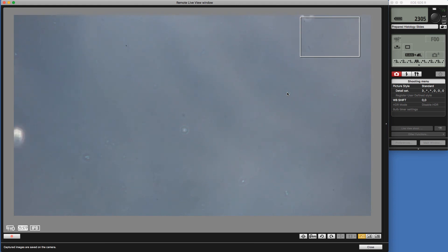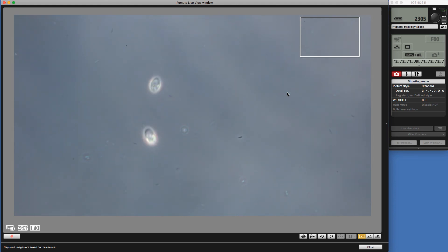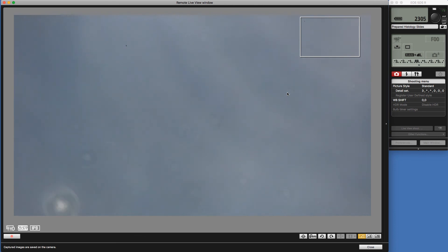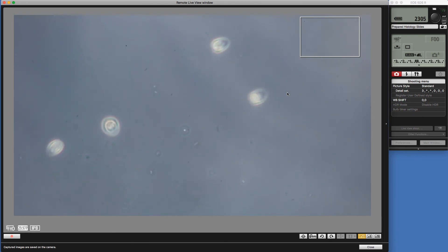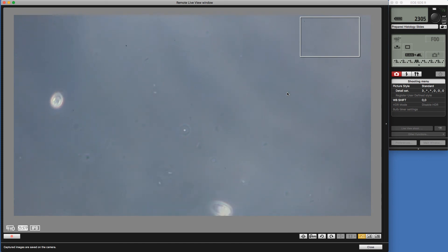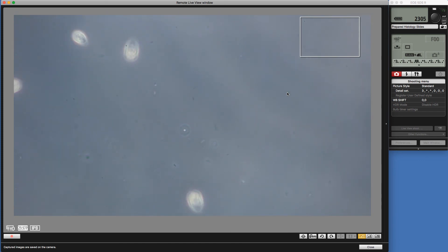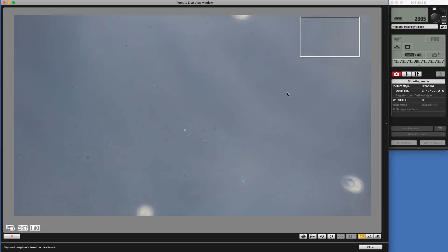We're at the 40x objective, but the annulus is still the phase 1 annulus, which is the wrong annulus for the 40x objective — it uses phase 2. So I'm going to rotate the turret to phase 2. Now we're at the 40x objective in phase 2. Let me focus the microscope to find the organisms. There they are. There you have it — phase contrast.